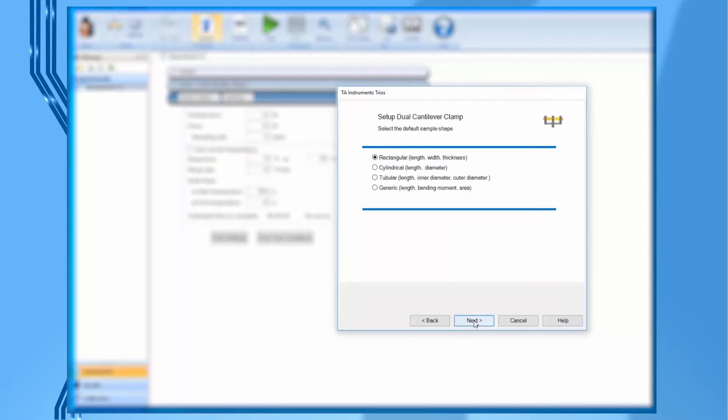In this page, select your sample geometry, for example rectangular, and then click on next again.